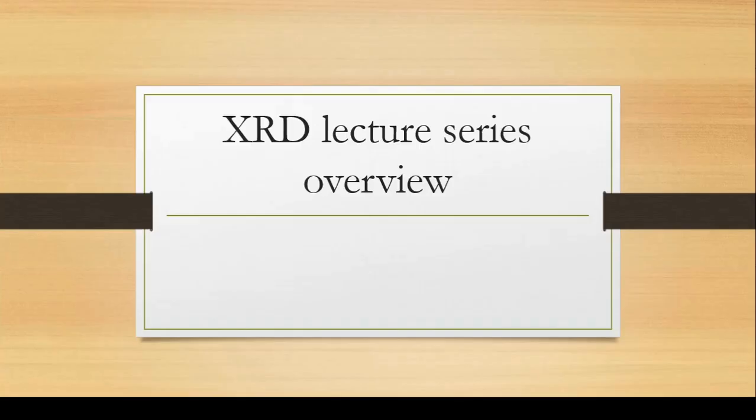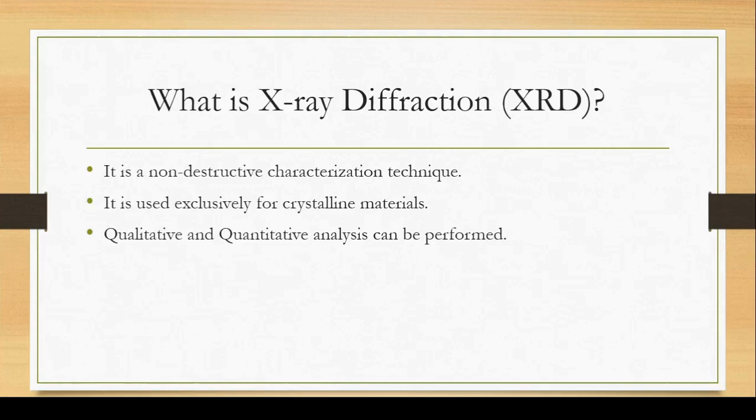Before we start, we should ask ourselves, what is XRD? XRD stands for X-ray diffraction. It is a non-destructive characterization technique. It is exclusively used for crystalline materials, and you can perform qualitative and quantitative analysis.